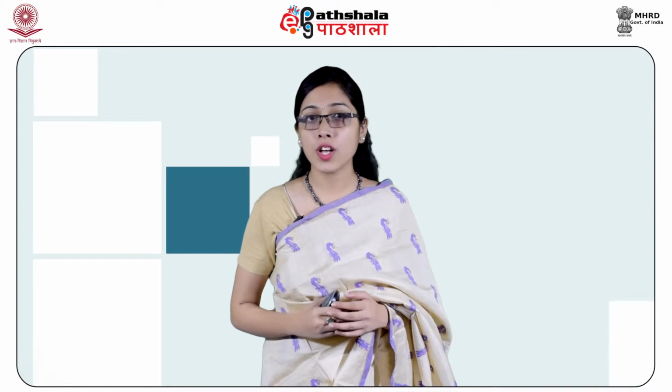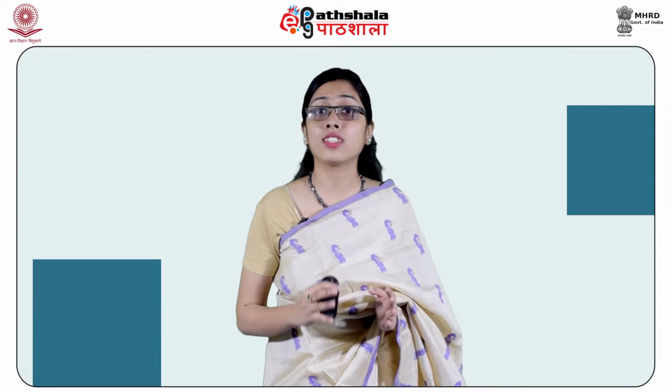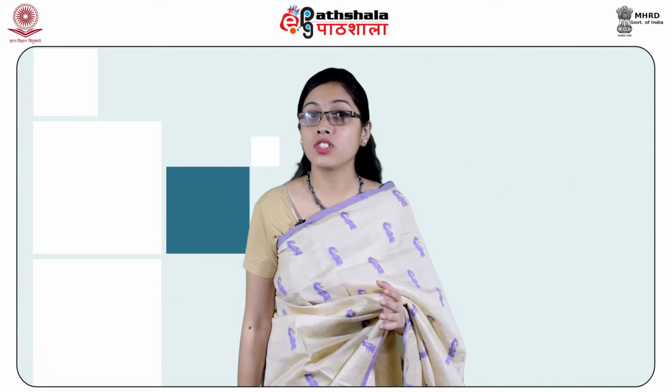Chromatography, as you all know, is a technique used for the separation and analysis of complex mixtures. The separation phenomenon was first reported by a Russian botanist, Michael Tswett, in 1906. He separated different colored constituents of plant extract by passing them through a column of finely divided calcium carbonate, alumina and sucrose. Tswett observed that various pigments such as xanthophylls and chlorophylls appeared as colored bands on the column, and he coined the term chromatography for this technique. The Greek word chroma means color and graphein means to write.